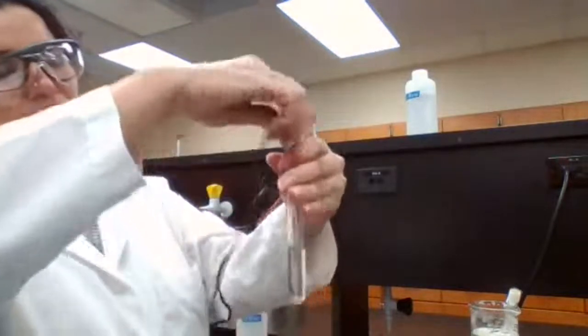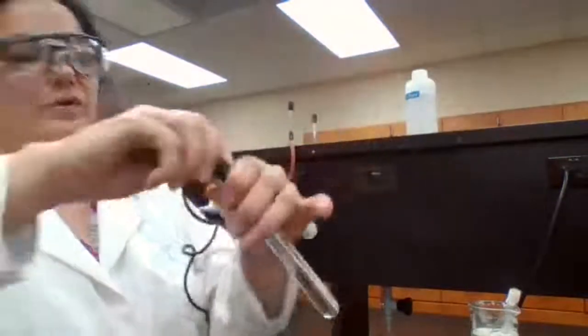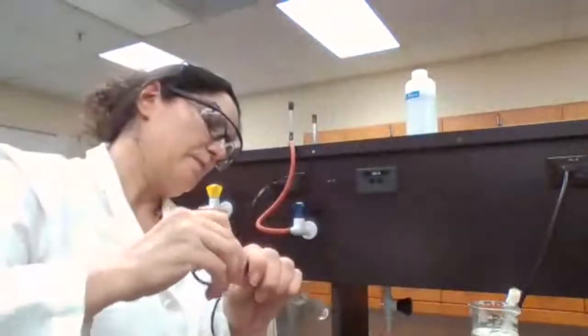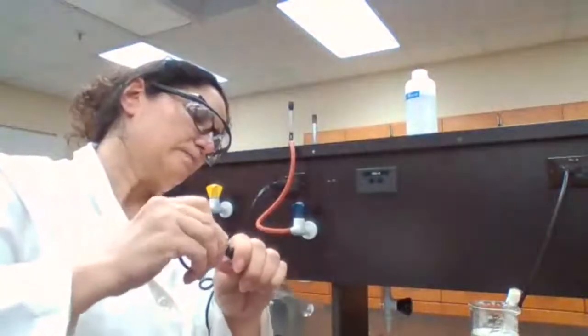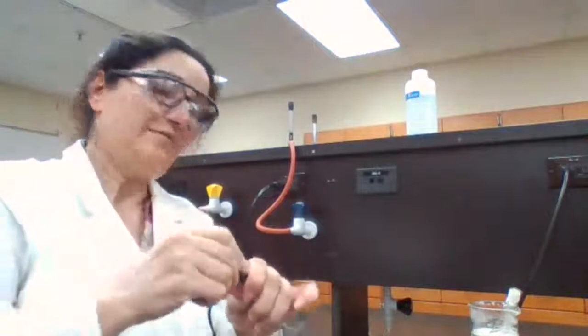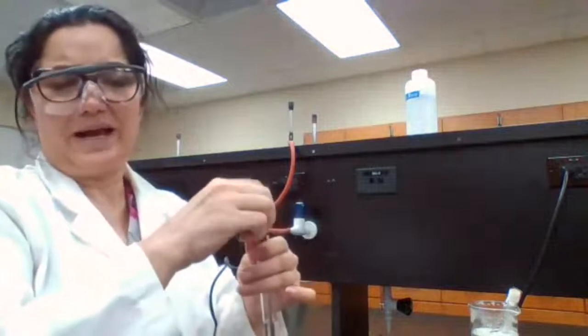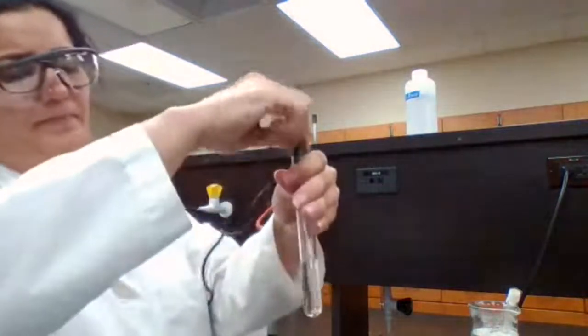So now the temperature has to go lower for the crystals to form. So now we know at room temperature, potassium nitrate has the solubility of 40 gram per 100 gram.